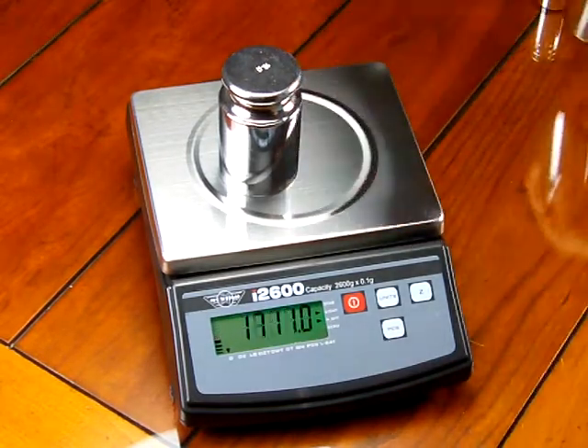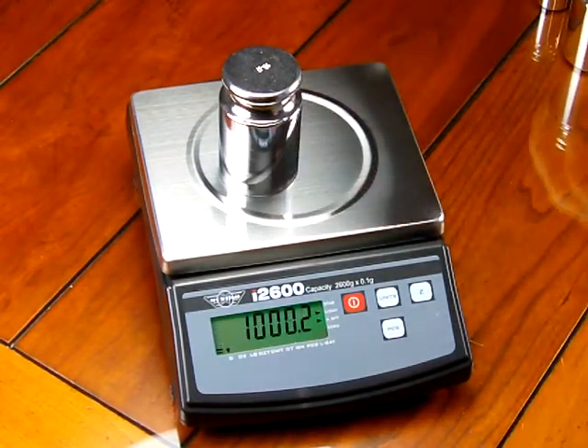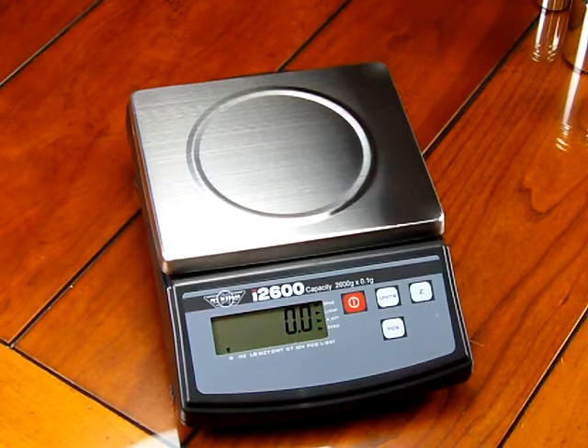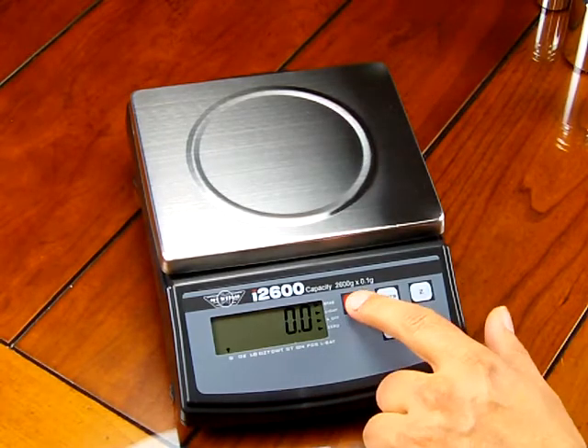We highly recommend that you always calibrate the scale. Calibration masses are an optional accessory, and we highly recommend you purchase them. So let's go through the calibration procedure.